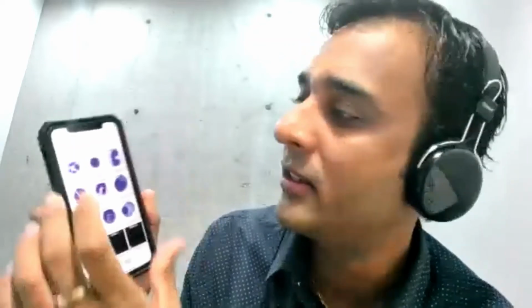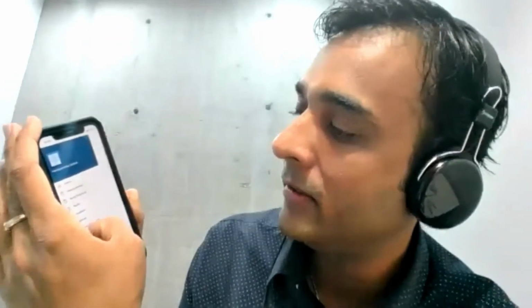So this one is very, very nice, very, very practical. Here you have one more option to find out the blood differential. It has another application to find out the blood cells: how you can count them and how you can differentiate them. It's very useful. Blood differential, you have your monocyte, how they look and all that. So you have very good information. This I like personally, and you can see the results. This is what you calculated, you already have it. All the results are stored.